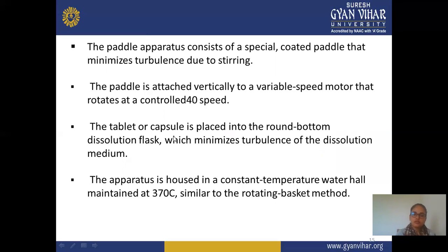The apparatus is housed in a constant temperature water bath maintained at 37 degrees Celsius. Similar to the rotating basket method, the temperature is the same for both type 1 and type 2, that is basket and paddle type. We maintain 37 degrees Celsius for this.